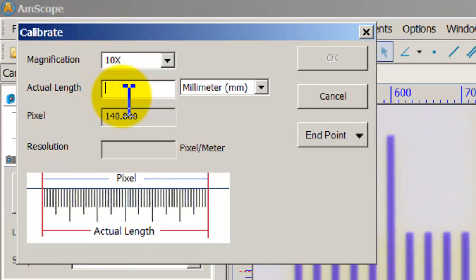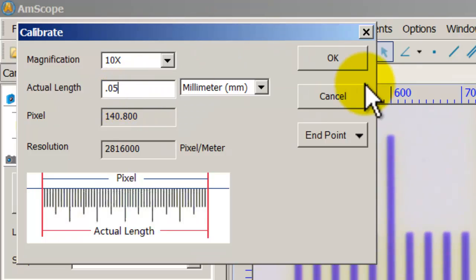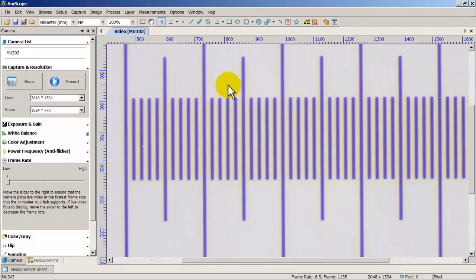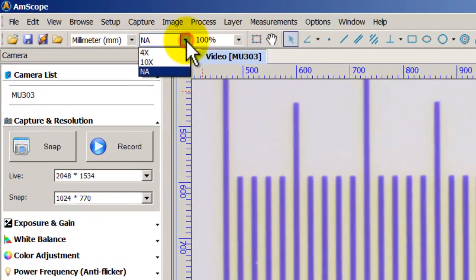That saved the calibration for the 10x objective. Now I have both objectives — 4x and 10x — saved permanently on this computer unless I uninstall the program or manually delete the calibration.